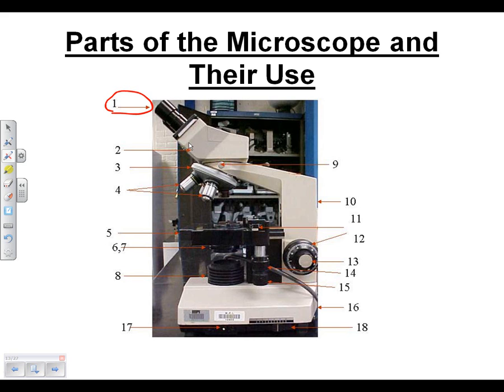The thing to keep in mind is it is in the instructional details that it gave you if you go look at the how to use microscope. And I don't remember quite sure if it's in the video or not, but you'll see that the oculars, one of them is adjustable, and that's meant so that if your eyes aren't quite the same, like mine, my right eye is stronger than my left eye, that you can adjust the microscope to compensate for that.